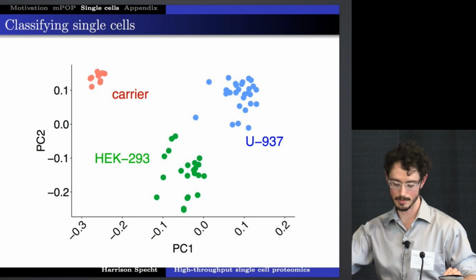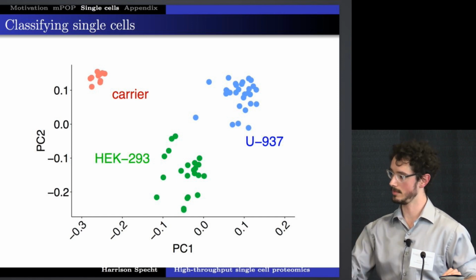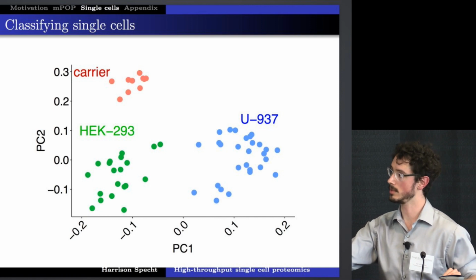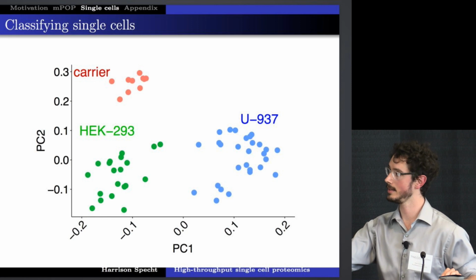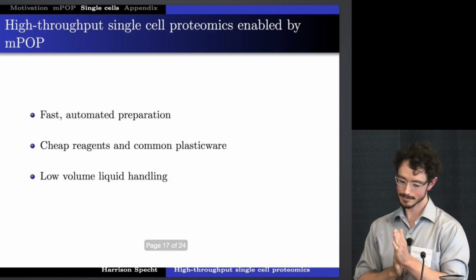If we do a common type of filtering at this point and look at only the proteins that vary across the different conditions, filtering on the variance, we see that we can then separate on the first principal component. This is encouraging, that we're truly seeing some structured signal in our randomized plate design, and that this signal corresponds to the 2 different cell types that we sorted. So that's a preview of the data.